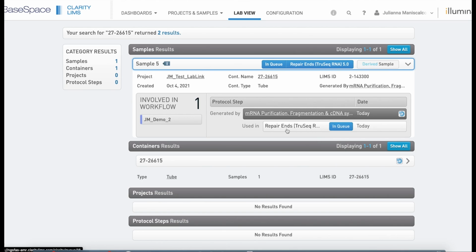These are just 2 of the options you have for the unhappy path, but will make the system more realistic to how you are processing samples in the wet lab.